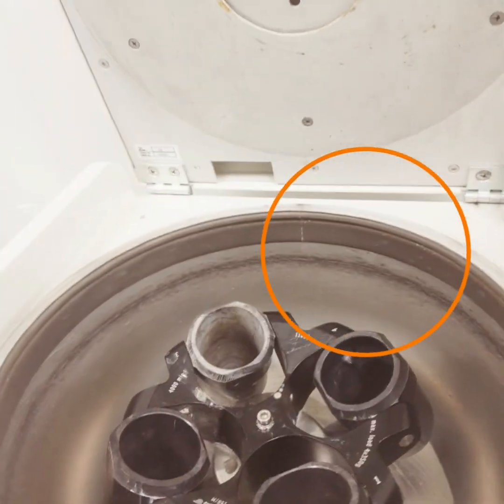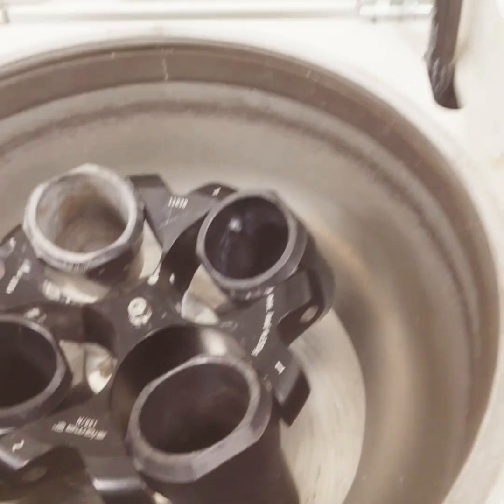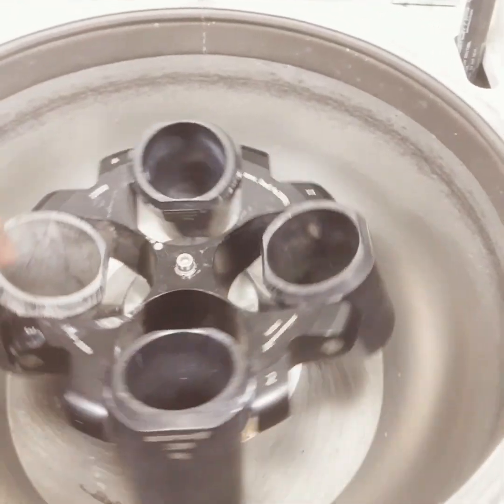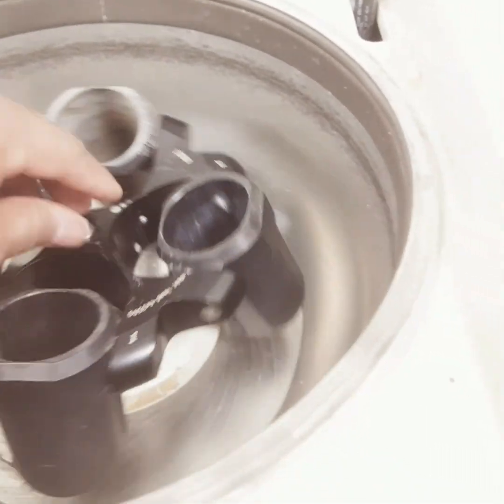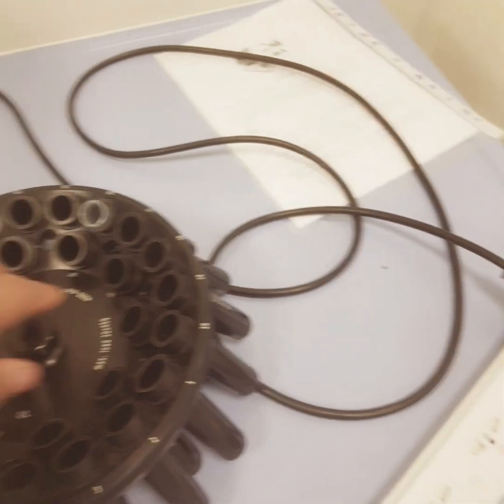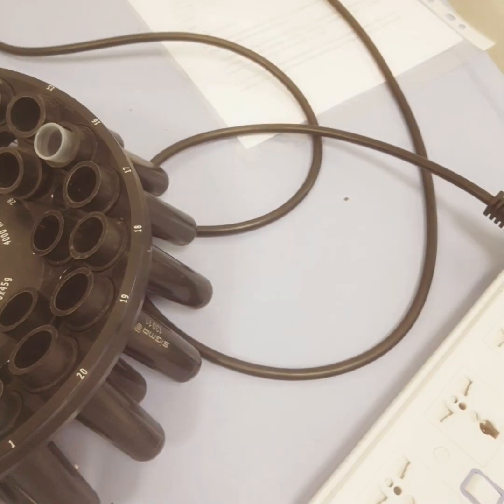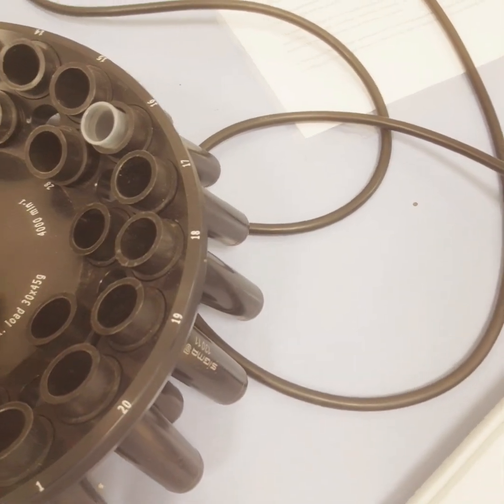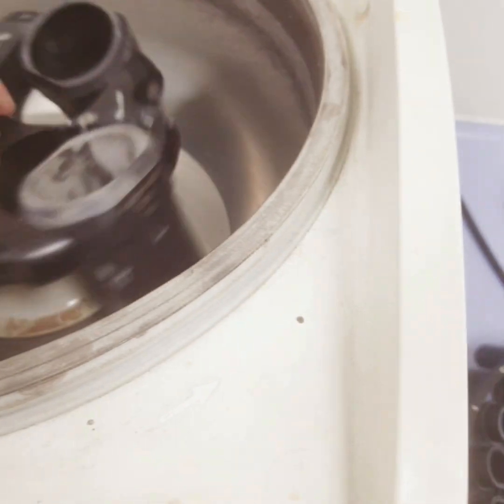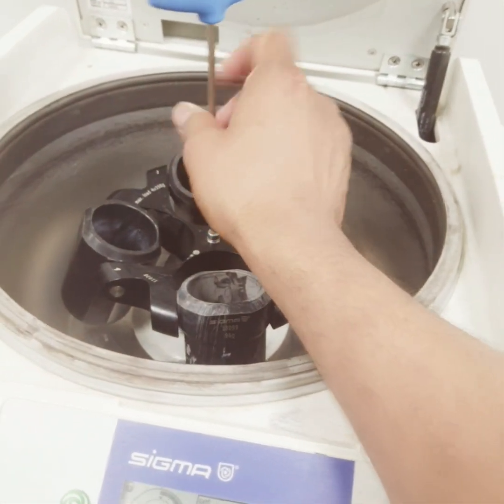Hello friends. In today's video we are going to learn how to change the rotor of the centrifuge. In front of us you can see this is a four-vial rotor. Our system comes with two settings: here we can place around 29 to 30 vials, and here we can place four vials.